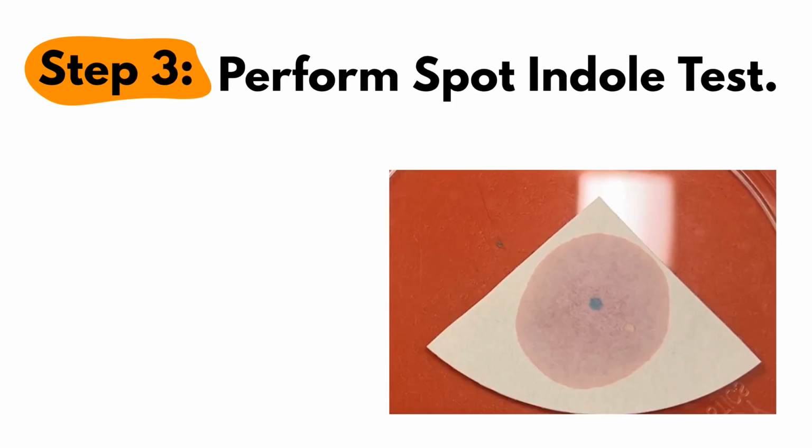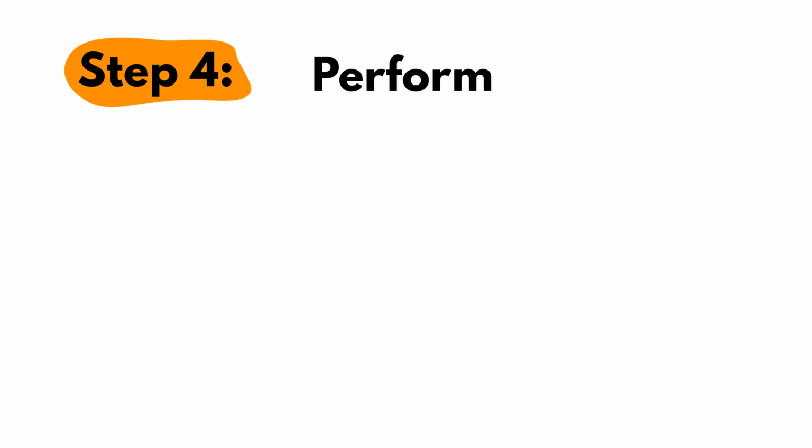Step 3. Perform spot indole test. The result is positive. Step 4. Perform PYR test.